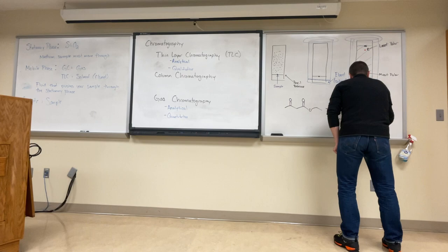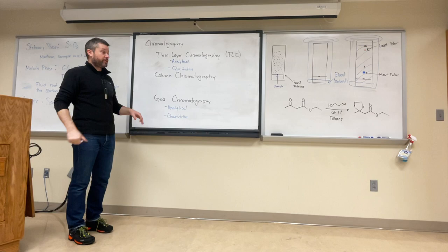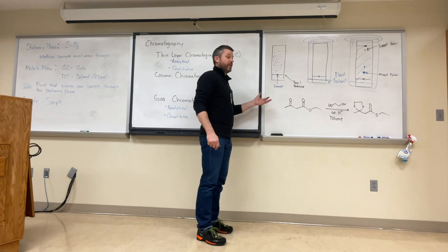Formation reaction a couple of weeks ago. We worked it up and we got the crude sample in a vial. So what you're going to be doing today is analyzing that sample. You're going to be figuring out if we made product, if that product is clean, if there's any other stuff in the reaction. All right?